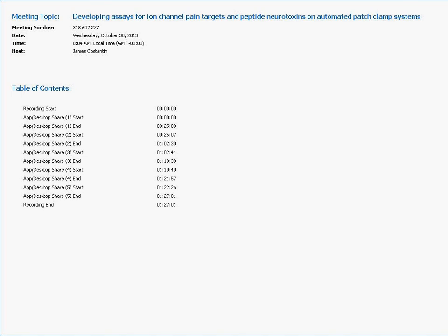Going from there, we started testing the other compounds, and I'll just be calling them derivatives 1 through 5. The first derivative that you see here is very closely related to the wild-type BRMT. We made this compound similar so that we could see if we could make a slightly different compound and if it would still be active. As you see here, the current traces look very similar to the wild type. When we look at the analysis of all the wells, you see that the IC50 here is 0.3 micromolar, which is very similar to the wild-type BRMT.